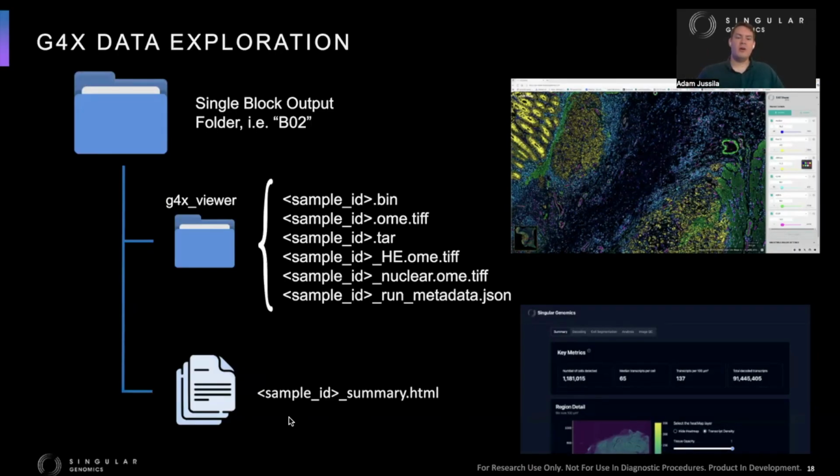Additionally, we want to help you immediately jump into QCing your data and determining whether or not the quality is meeting your expectations, or if there are any concerns that you want to address with us or in your own labs. This is found in our summary HTML that I'll talk a little bit about in a moment.